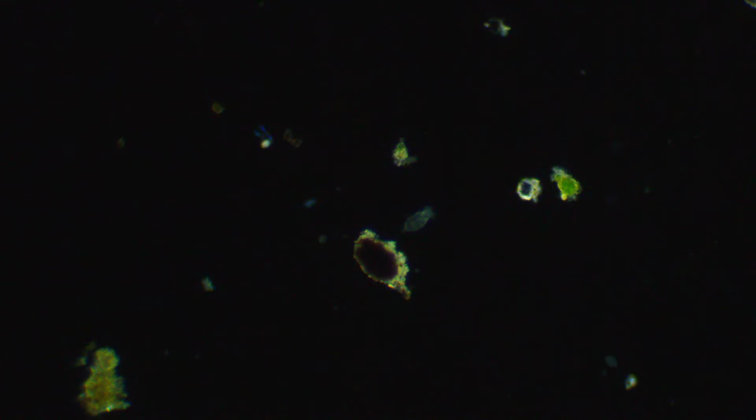There he goes. He's cleaning the water. His little rotifer, you can see it spinning. His little head, his little wheel. Oh, I don't know what he's doing. I think he caught something there. Keeps doing that. And he can slowly spit out the little rotifer. There you go. Spit it out, and we'll spin it around. We'll suck up some more water. There you go. Oh, you missed that one. Oh, you got some. Keeps doing that.